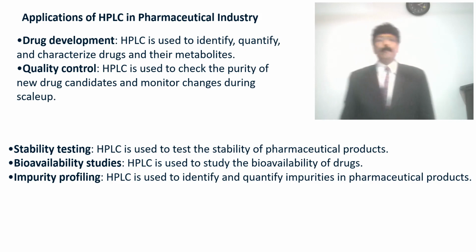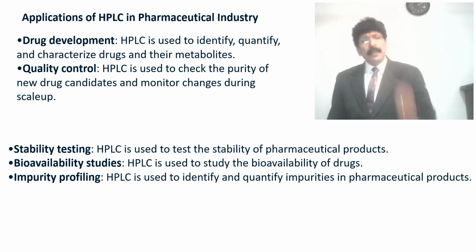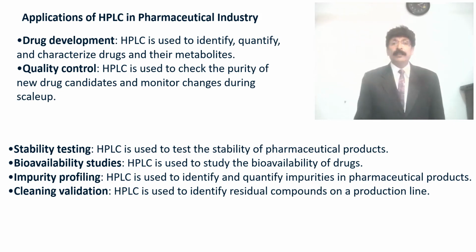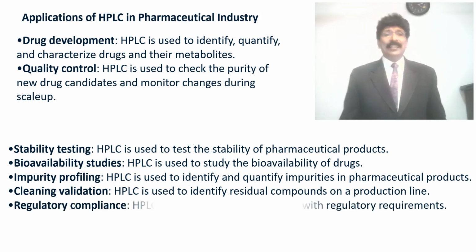Impurity profiling: HPLC is used to identify and quantify the impurities in pharmaceutical products. Cleaning validation: HPLC is used to identify residual compounds on the production line.